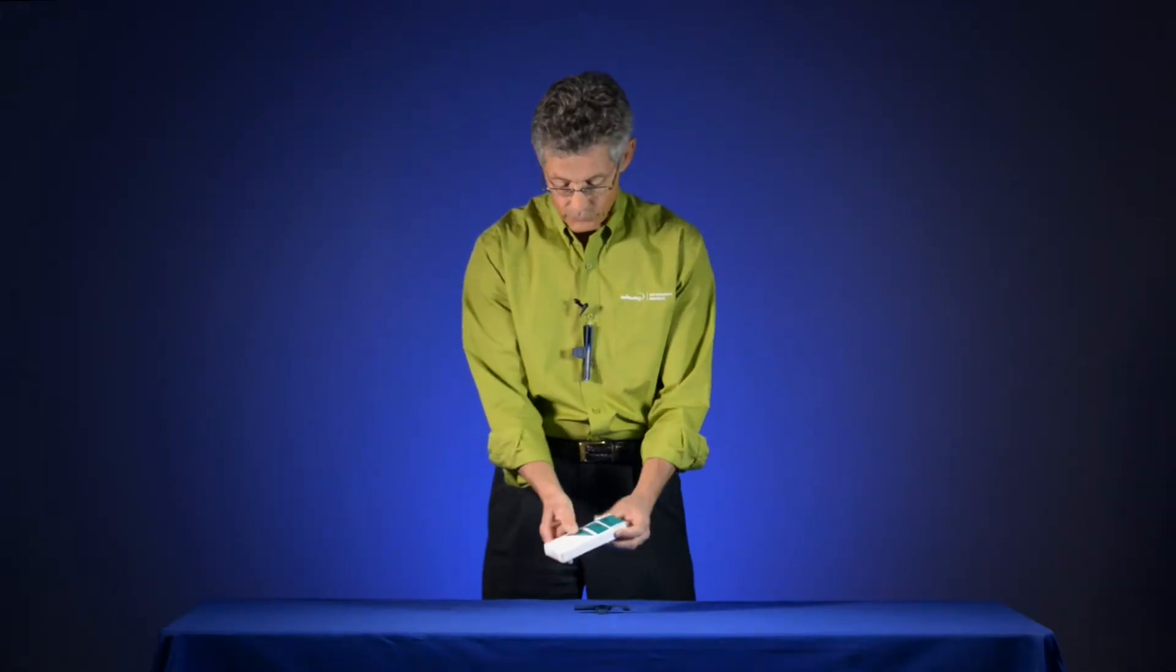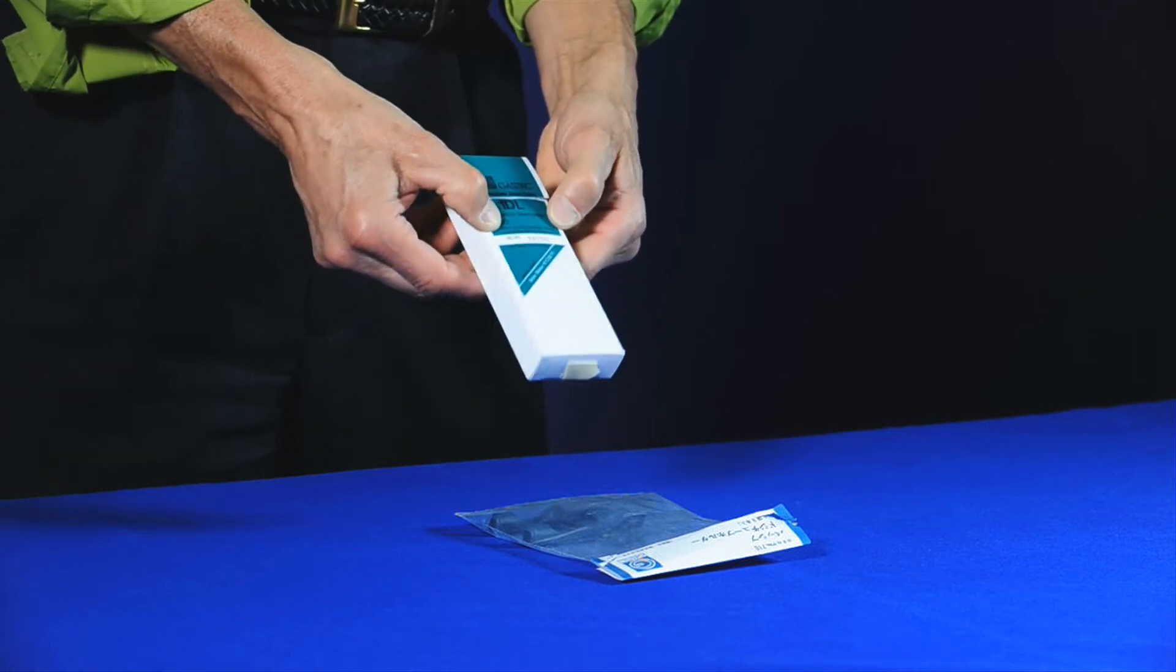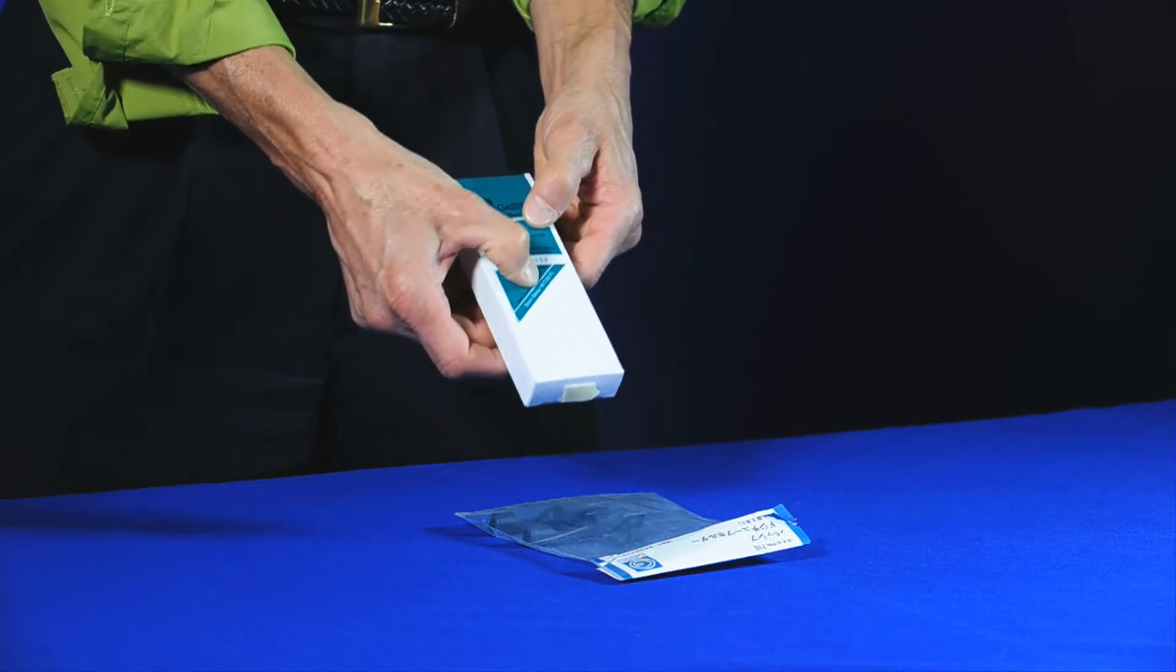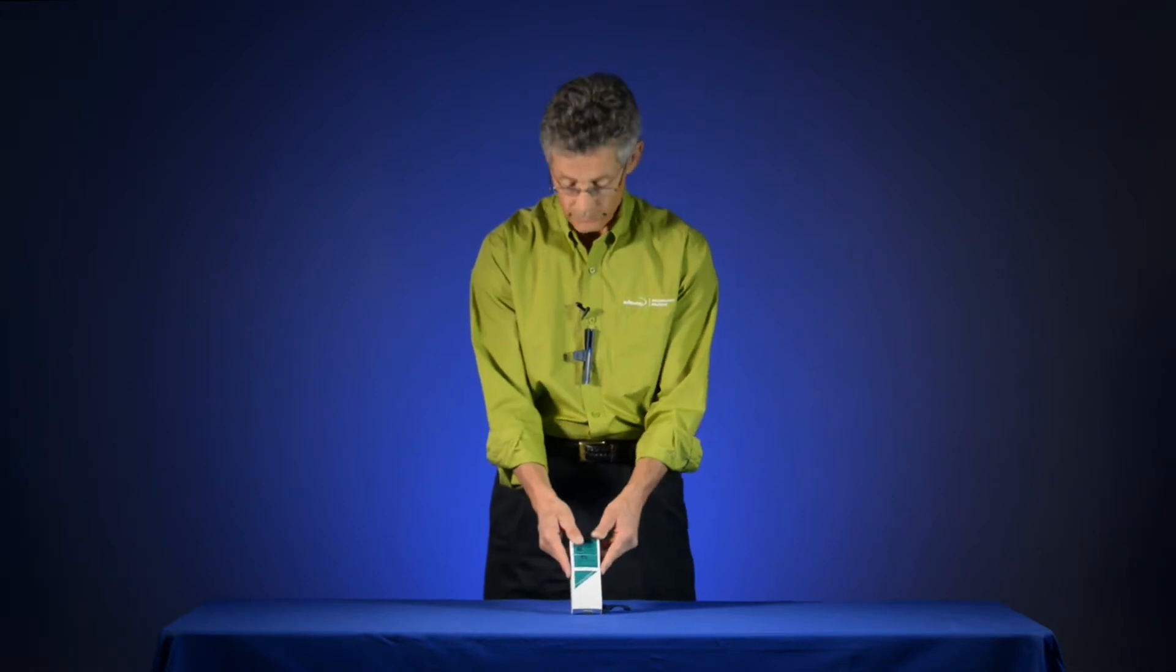So when you get a box of DOSI tubes, you're going to notice a couple of things. There's a QC number on the front, which refers to the lot number that is manufactured. They'll give you the range. It says store below 10 degrees Celsius because these tubes like to be kept cool and dark.